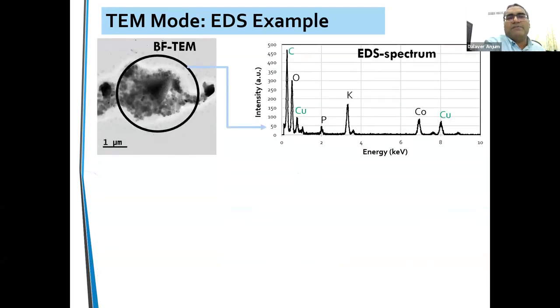Now I'm going to show you some of the things that can be done by using the spectroscopy mode combined with the imaging mode in TEM. This is applied to a nanomaterial, with small-sized nanoparticles. We take an image and we do EDX on it.